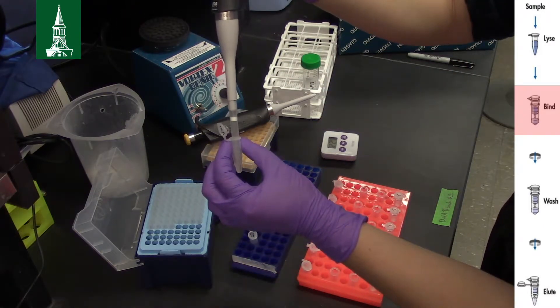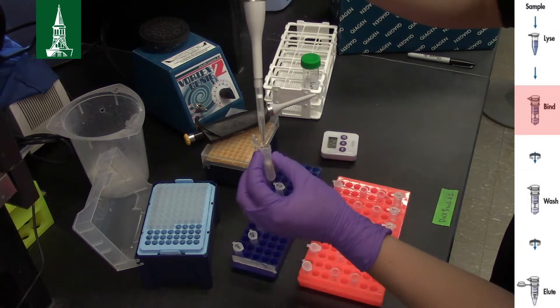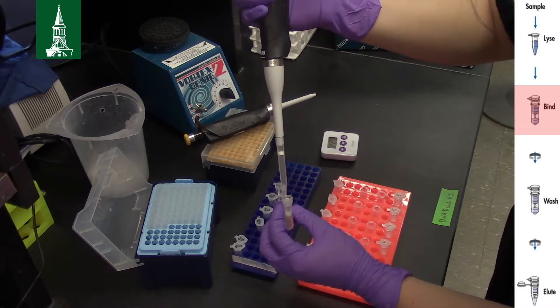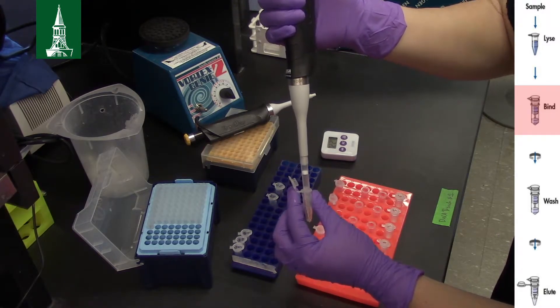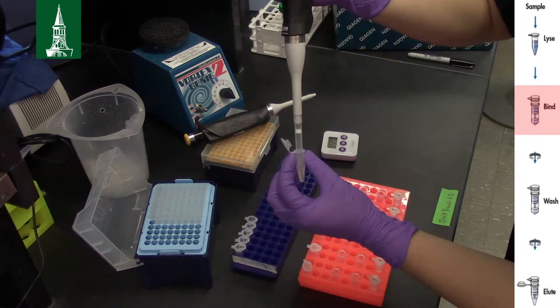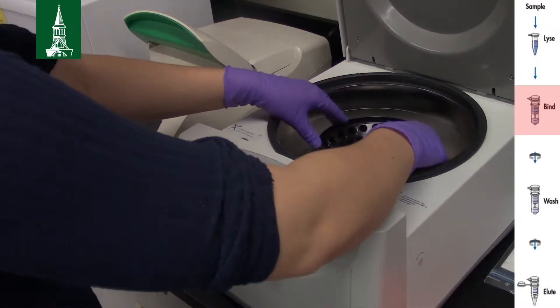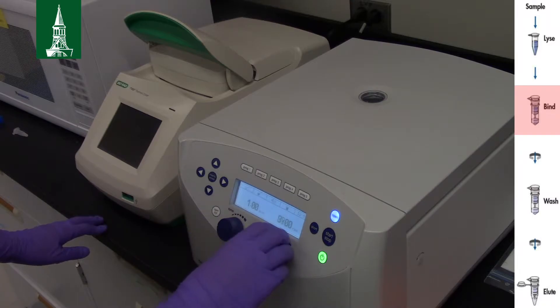Pipette the mixture from the previous step, including any precipitate, into a DNeasy mini spin column placed in a 2 ml collection tube prepared earlier. This should be about 600 µl and roughly fill the spin column. Make sure never to touch the white membrane in the spin column with your pipette tip. Centrifuge at 8000 rpm for 1 minute. All centrifugation steps are carried out at room temperature in a microcentrifuge. Make sure to always balance the centrifuge.